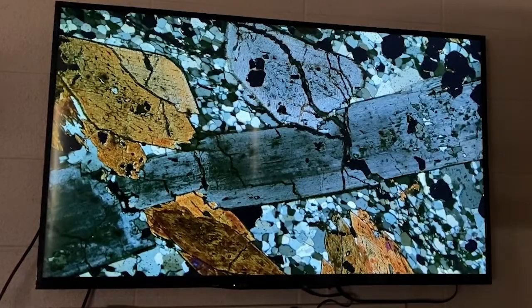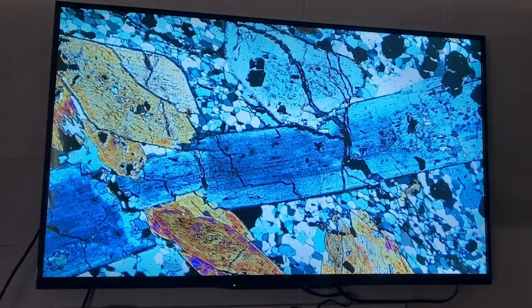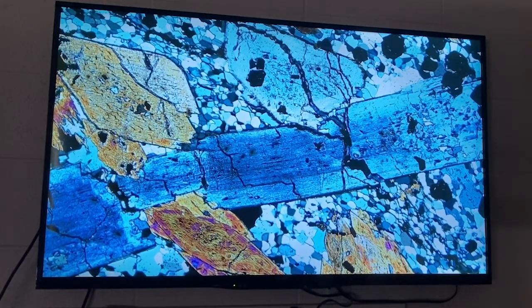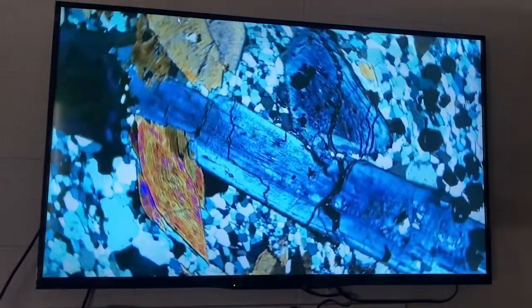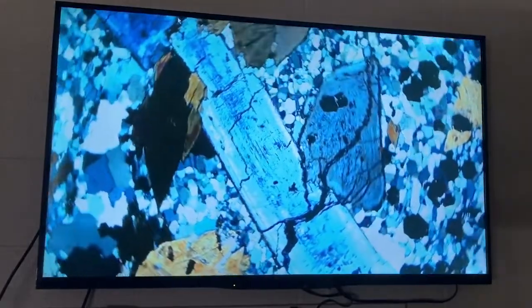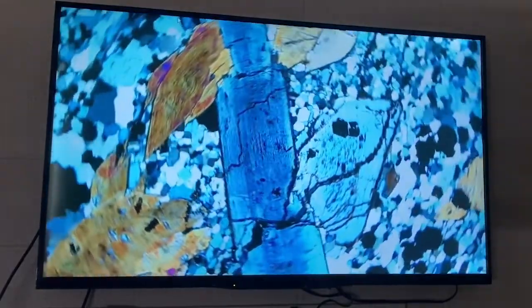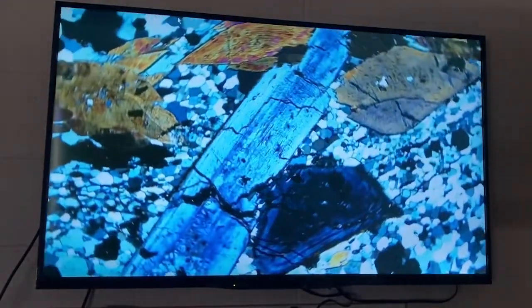As we switch to cross polarized light, we can see that glaucophane has second-order interference colors. Glaucophane's interference colors can range, but they're always somewhat higher. We can also see that it has parallel extinction as we rotate the thin section under cross polarized light.